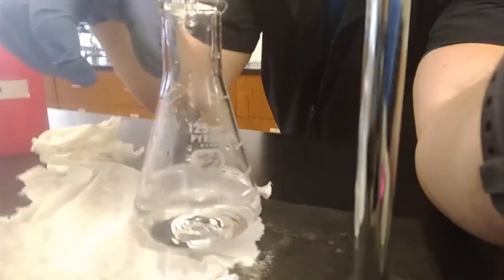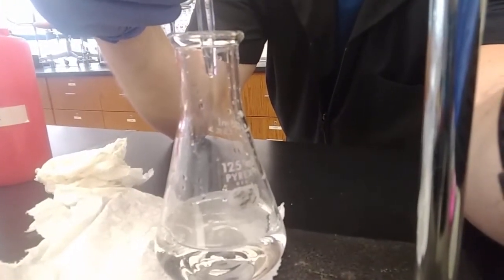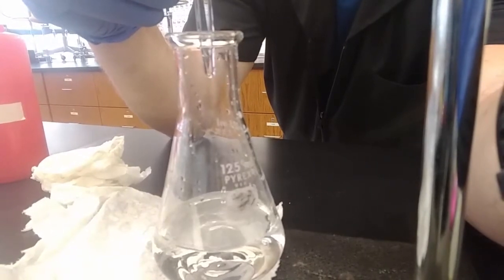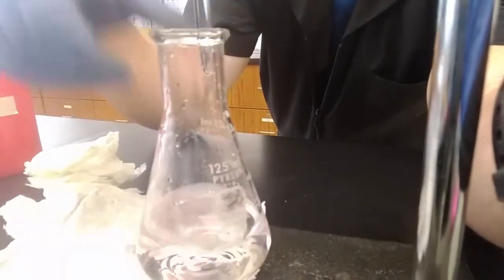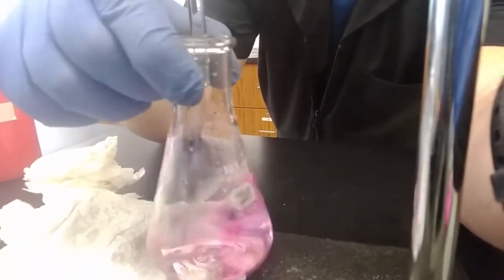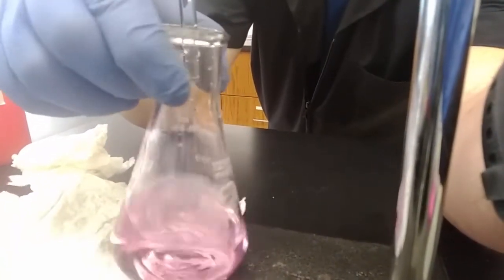One drop. Two drops. Three drops. Four drops. Tape underneath. Third drop did it, didn't it? Lightest shade of pink possible.